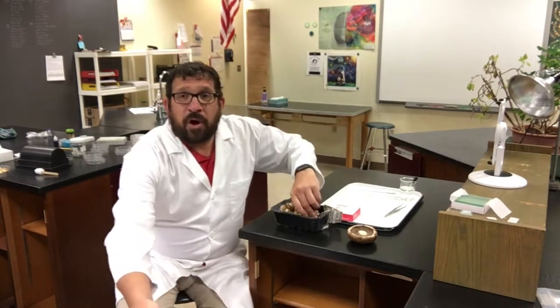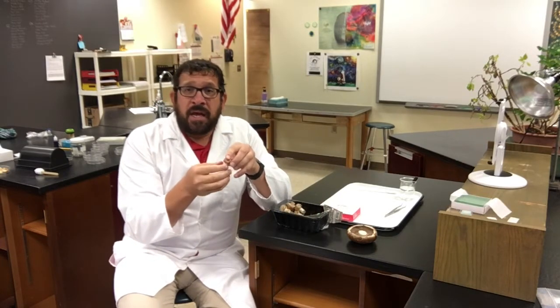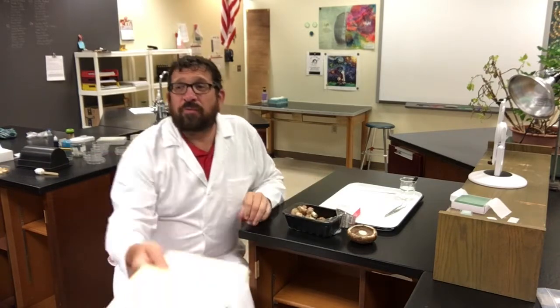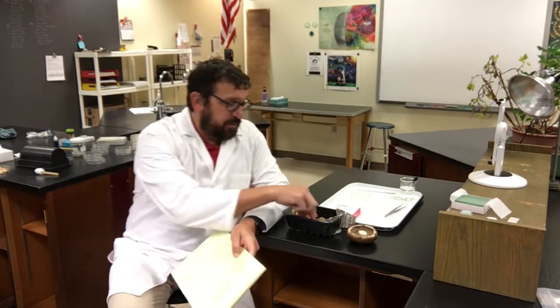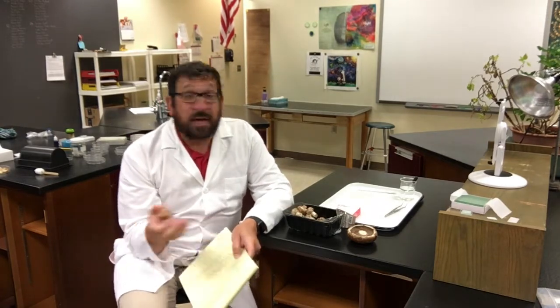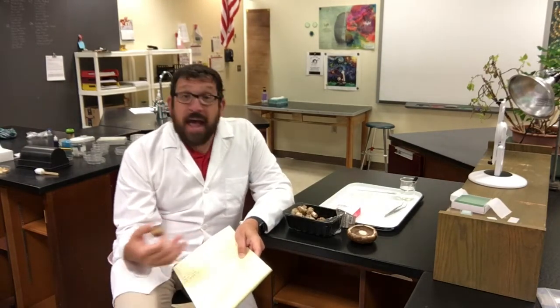I want to look at the different parts of what makes up a mushroom. All the different parts and names of the mushroom, what's inside, and kind of just an overall view of what fungi is. I'm going to be pulling apart these different pieces of the mushroom. We'll look at it under the stereoscope, we'll look at it under the microscope. And that's about it. I'll go over the equipment that I have here as I'm using it. So pay attention. I'll put any terms down underneath the video that you might need for the quiz that's going to follow this.